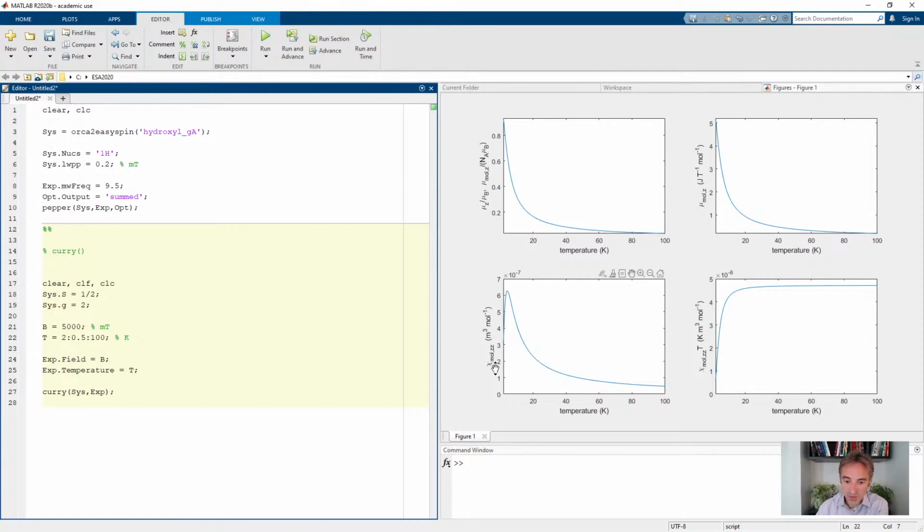On the bottom, we have the magnetic susceptibility, which is kind of the derivative of the above quantities. And the molar magnetic susceptibility is shown here in the bottom left in cubic meter per mole, and you can see it rises and goes through a maximum and then starts decaying. And another quantity that's plotted quite often is the product of the susceptibility times the temperature, chi T, in units of Kelvin cubic meters per mole.